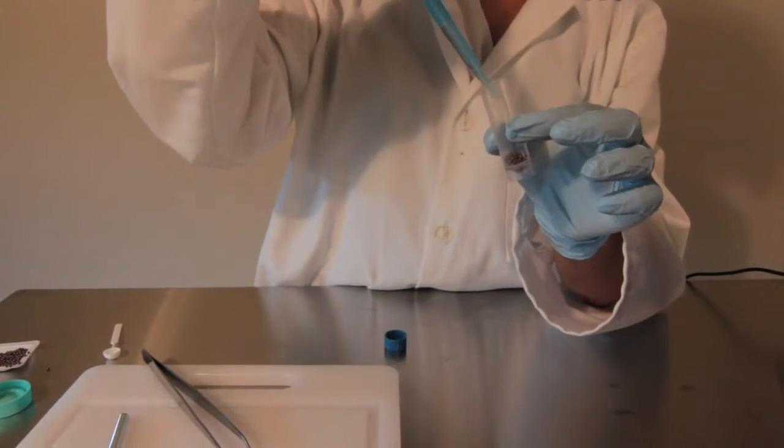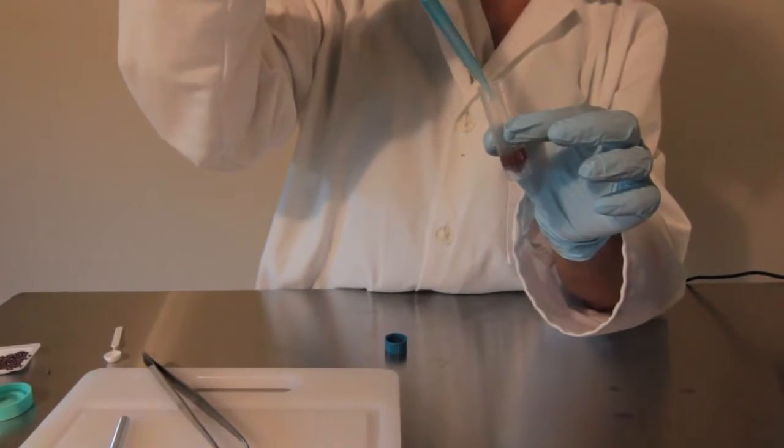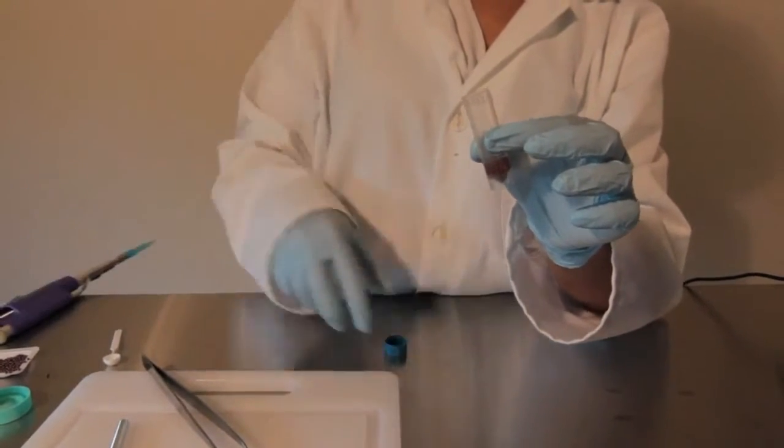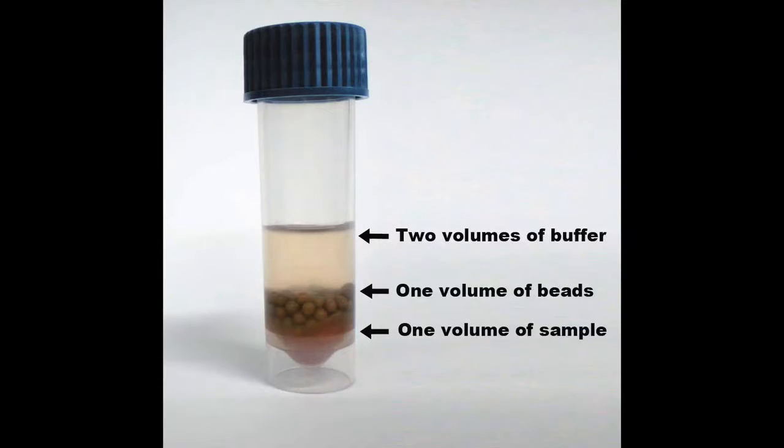Finally, add the reagent or buffer that you would like to homogenize your samples in. We recommend using a volume of buffer equal to twice the volume of beads that you use.